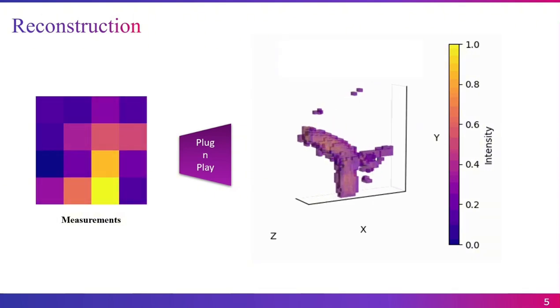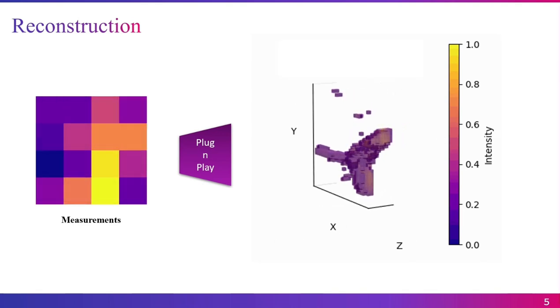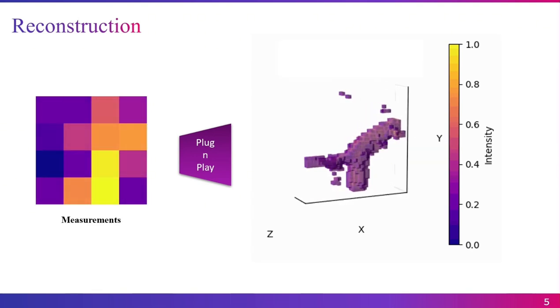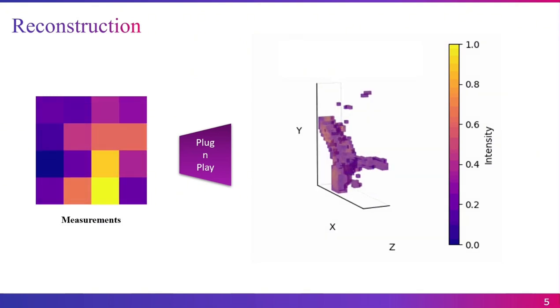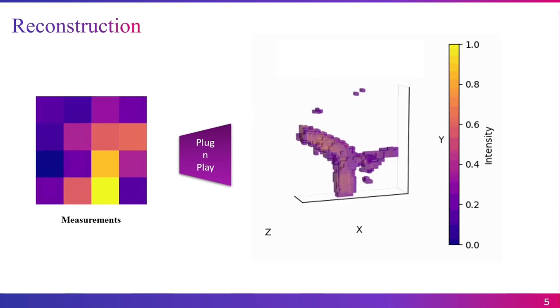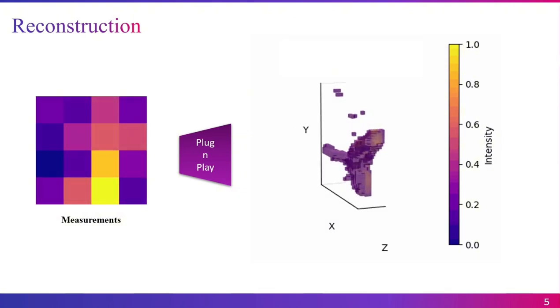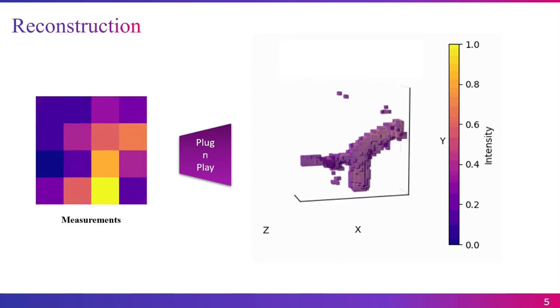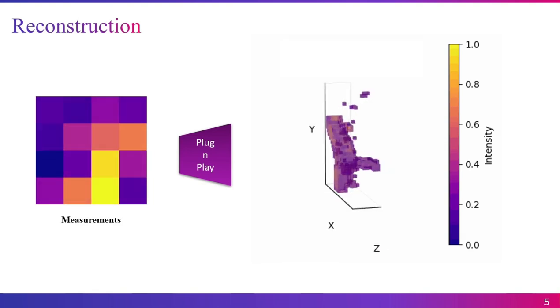So under this method, we used plug and play. We combined three two-dimensional denoisers to implement a highly effective three-dimensional prior model. Our approach integrates three two-dimensional denoising convolutional neural network priors using multi-agent consensus equilibrium. MACE is an extension of the PnP framework that formulates the inversion problem using an equilibrium equation in contrast to optimization and allows for the use of multiple prior models and agents.